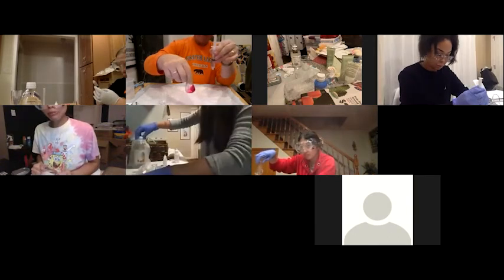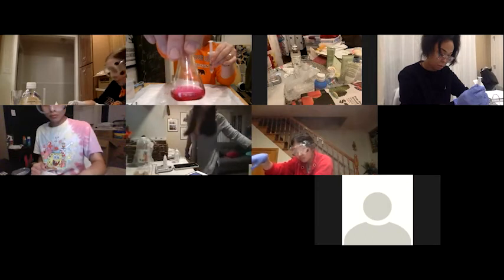Ooh, it took about 4 or 5 shakes. Oh, damn it, I went over. See, I went over. So I think I went 1 drop too many. So yeah, you want a color that's a little less than that. That's pretty close, but it probably could have been better. I tried to add 1 drop and I added 2. So yeah, I could swirl this all day and it doesn't change back.